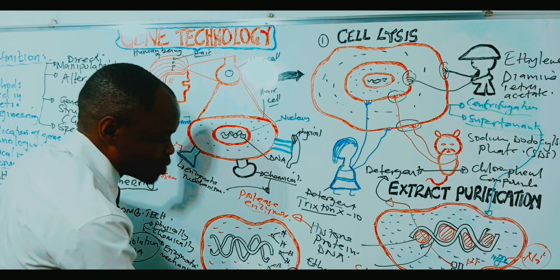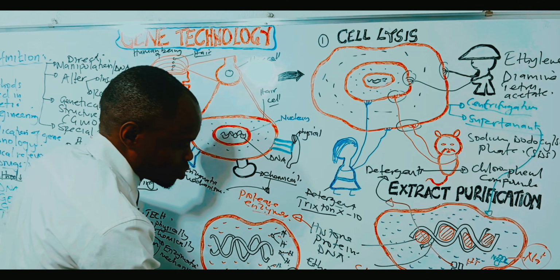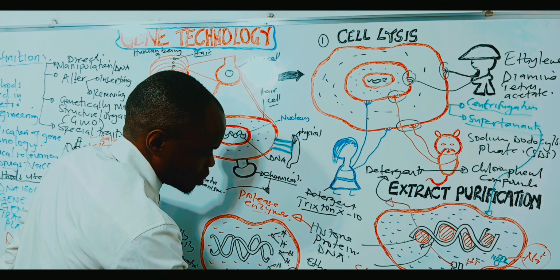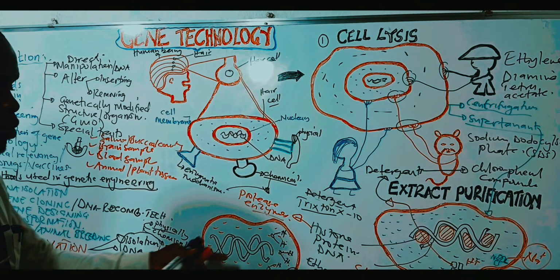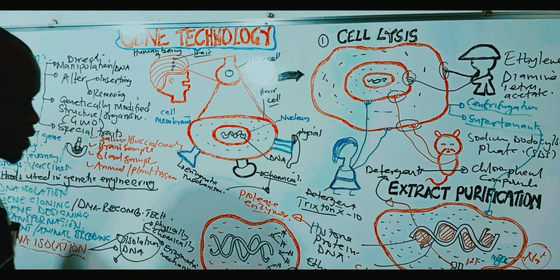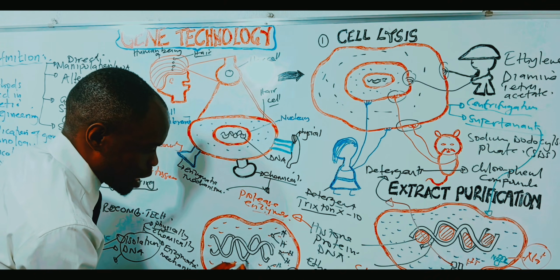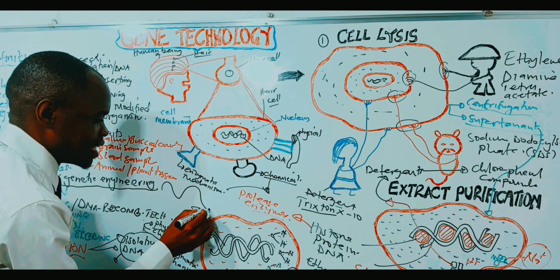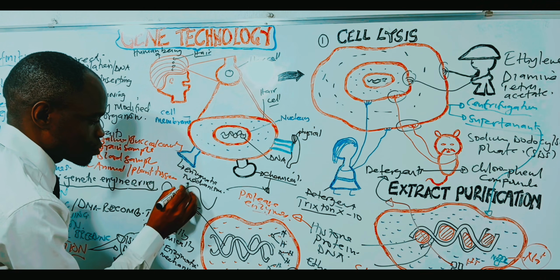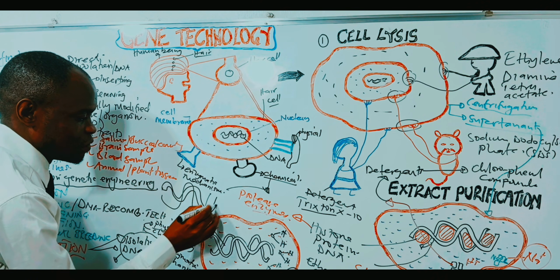Sometimes we make chilled ethanol, the chilled ethanol, in the presence of the sodium ions. We call sodium a metal. We shall be able to remove this, and therefore we shall now have a proper DNA. A proper DNA is going to be here. A proper DNA. You get? This is called a proper DNA we are having.